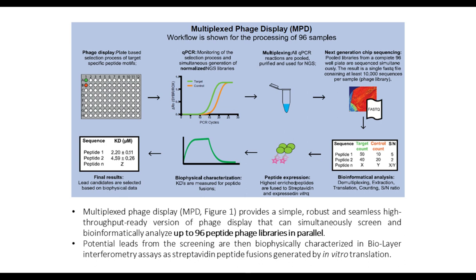So, technology overview. What we're going to do is Multiplexed Phage Display. First, you start off with the regular phage display process. But instead of doing phage titration assays to evaluate the phage concentration, we're going to come in with qPCR. This is nothing new.